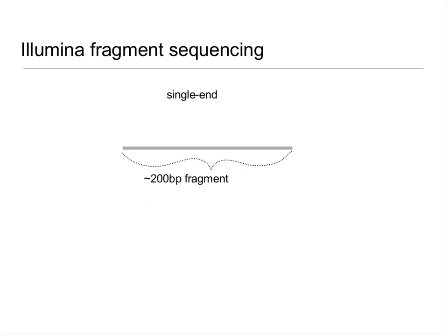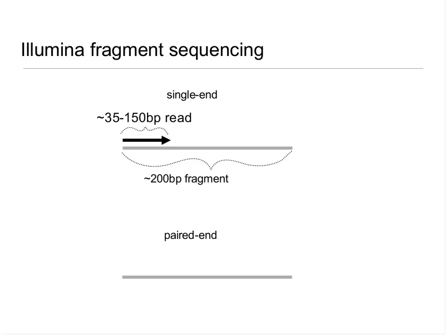So I told you before that what we're actually sequencing are the ends of these cDNA fragments. Each fragment is typically 200 to 300 base pairs long. And what the sequencer is doing is actually just reading off one end, in the single end case, of this fragment. And that piece that we read off is called the read, and that's usually much shorter than the fragment itself. We also have data called paired data.